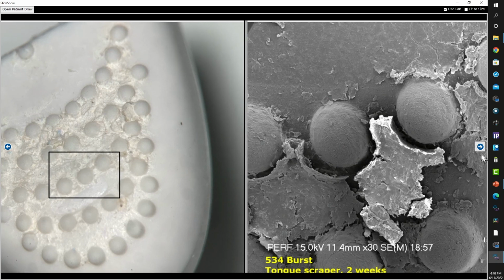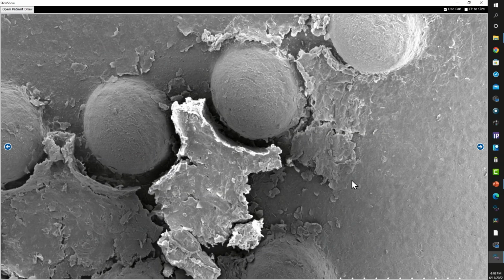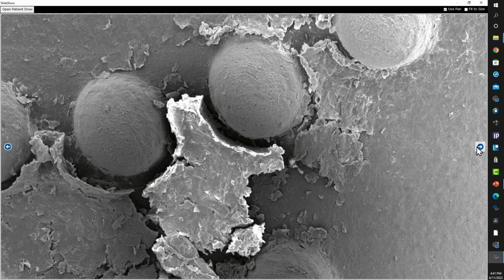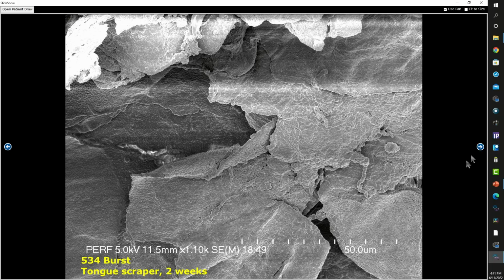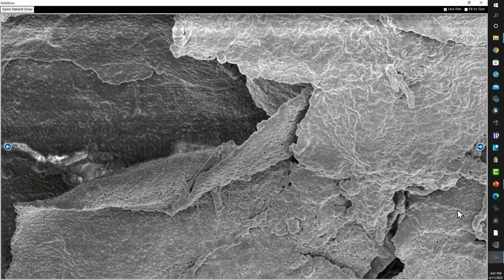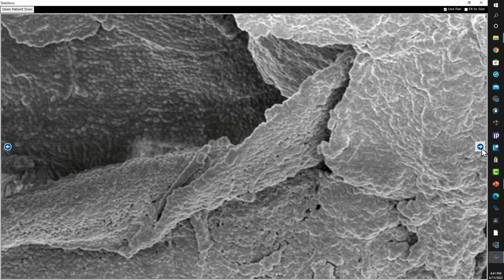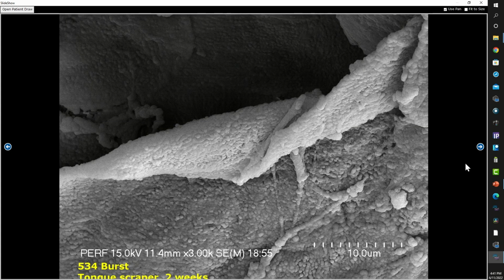And when you actually look at this under the scope, you gain a completely different appreciation for how biofilms function and appear in nature. So you can see the little domes there from the tongue scraper device, and you also see that the surface is covered with a layered structure, and upon closer examination with the SEM, you can see that these are very extensive biofilms that are laid down apparently in layers.